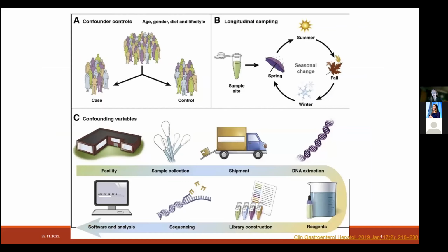So this slide just shortly shows that from creating a study and designing a study to obtaining data in your computer, there are a lot of steps to be taken. So we will talk shortly about them, and each of these steps should be thought out. And there are numerous things that we should take into account before we proceed, because we would like to get these results in high quality and to be sure that everything before this is done well.